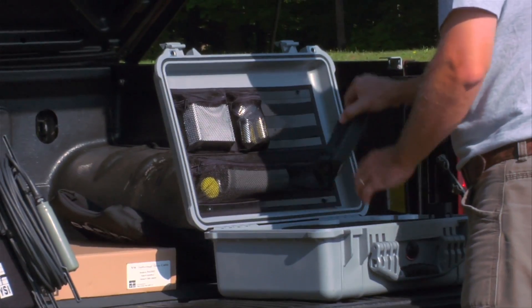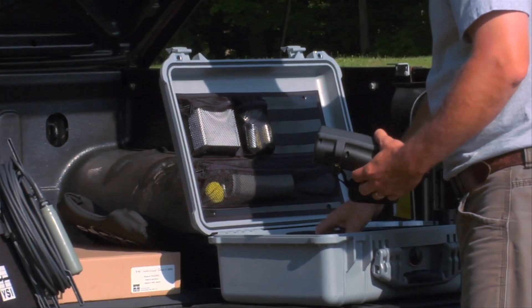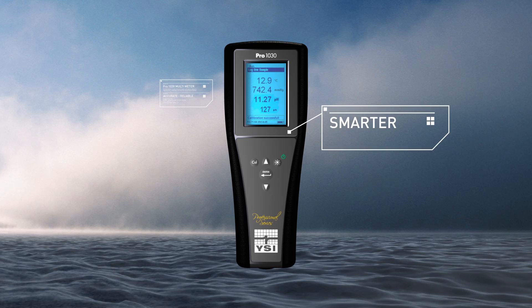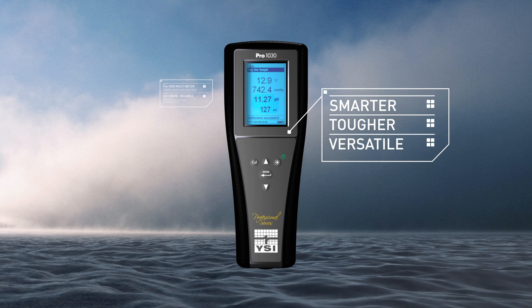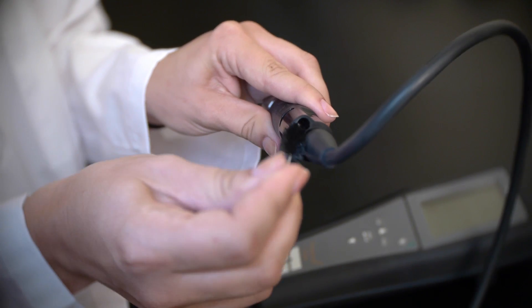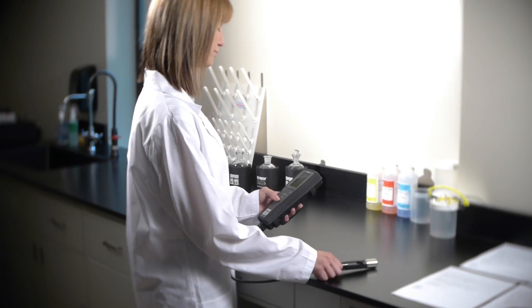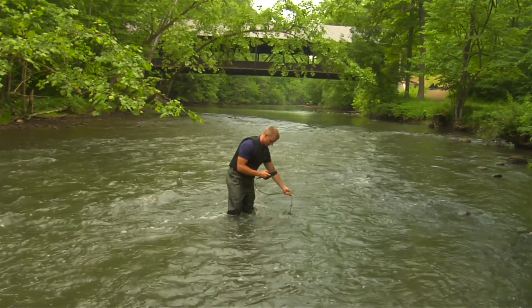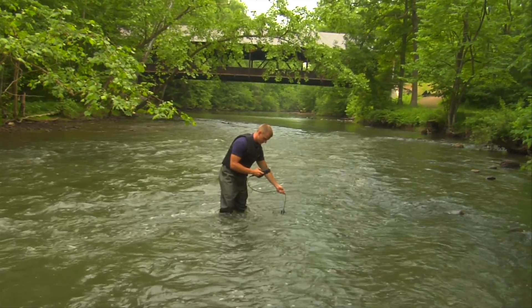The feature set of the Pro 1030 results in a low total cost of ownership over the life of the product and proves that it is smarter, tougher, and more versatile. The super-stable 4-electrode conductivity cell is built into the cable and will provide years of accurate data. The cells are designed for rugged field performance and are easily cleaned and require minimal maintenance.